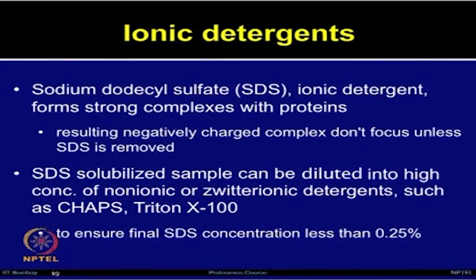However, if later on your aim is to perform protein separation by using isoelectric focusing or other gel based methods, it is going to create some problems, because the SDS will bind to the proteins, which will result in a negatively charged complex, and that will not focus unless the SDS is removed from the protein sample mixture.